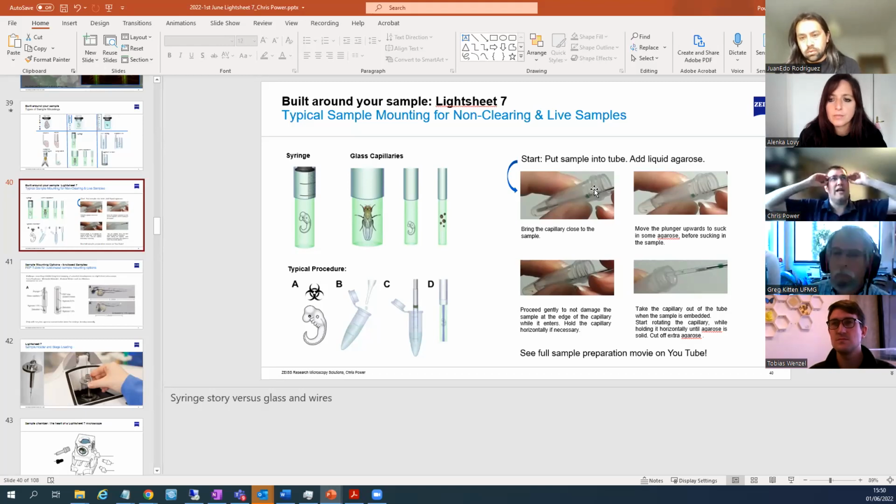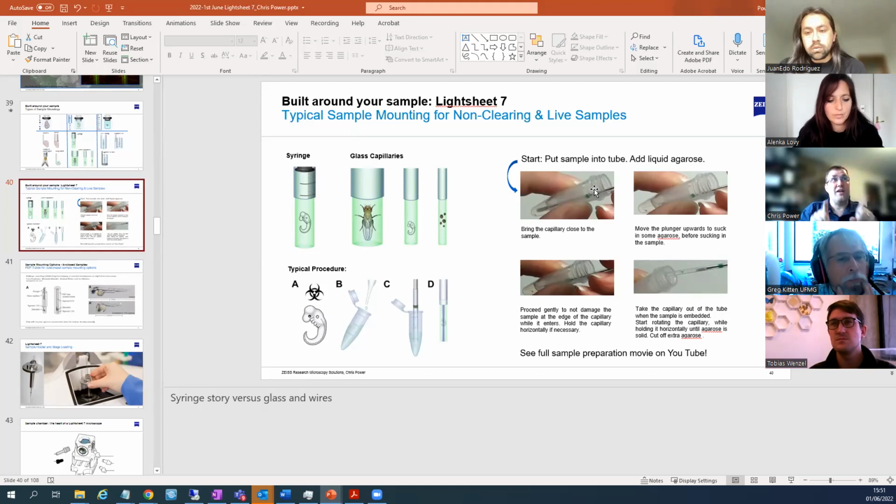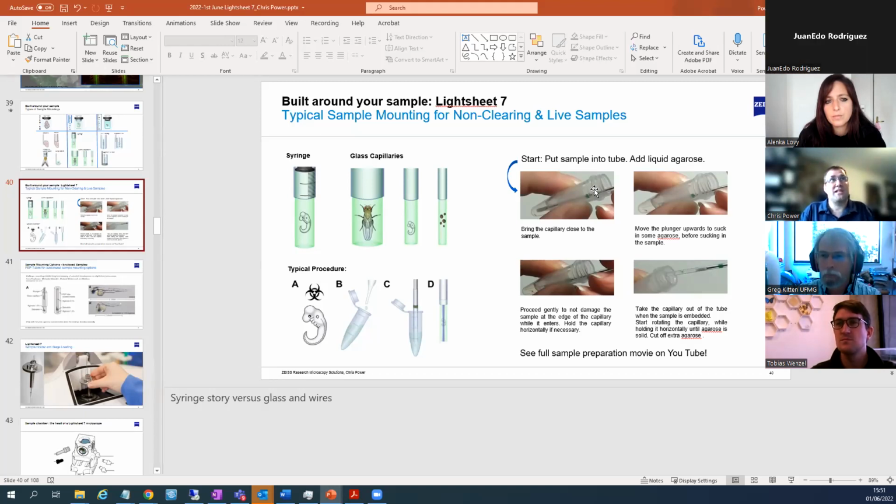The thing you have to get your head around in Lightsheet is that in confocal, when you go deep and light scatters, your image goes black. In Lightsheet, your image goes fuzzy. So you have to think, what do you care about? If you care about resolving actin filaments, a confocal will go deeper than Lightsheet. If you care about counting nuclei, which are big blobs, then Lightsheet will go deeper. But in terms of the magical recipe for depth penetration, it's still a light-based system.